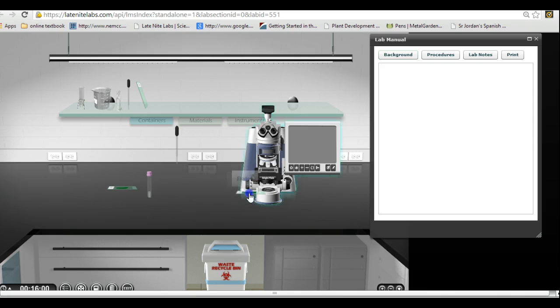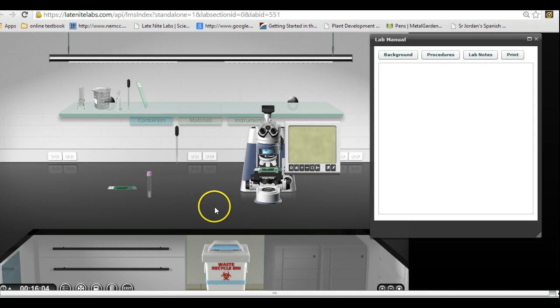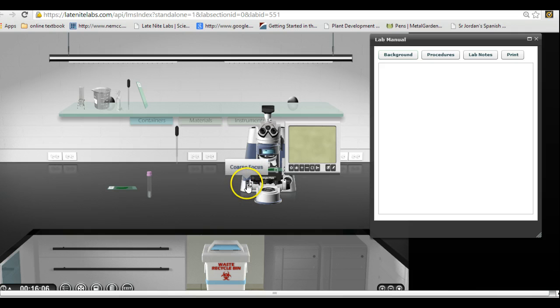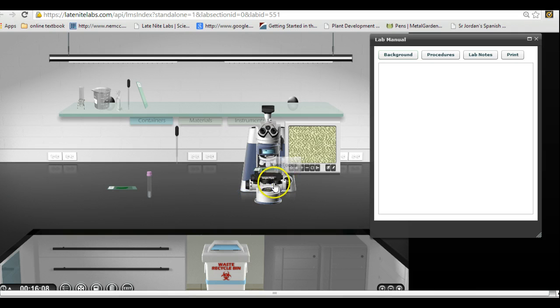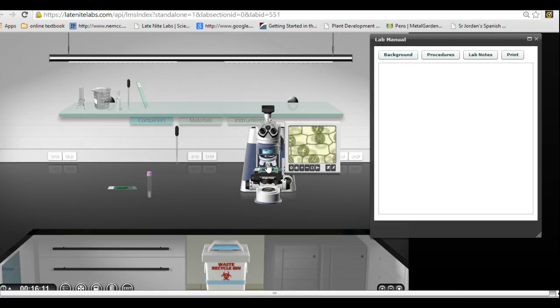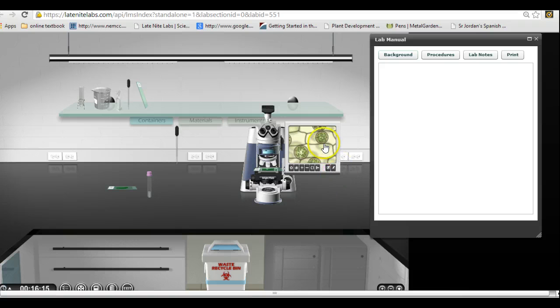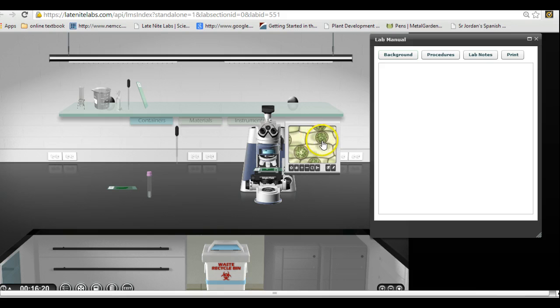I'm going to put this back on the microscope. There we go. We'll focus it again. Okay, there we go. At scanning, let's go up. And actually, that's pretty good right there.